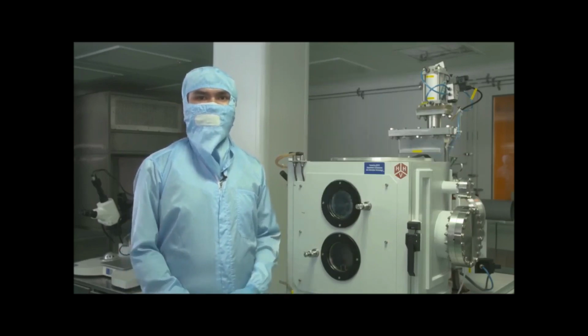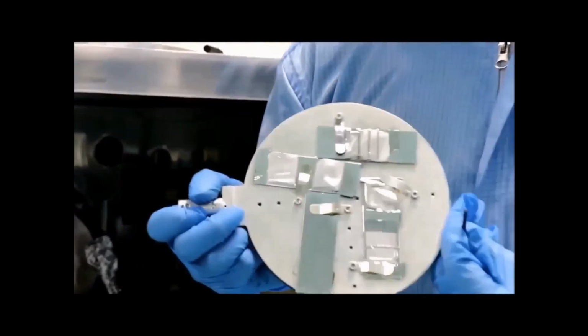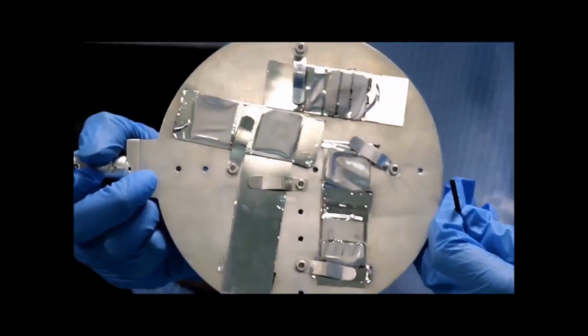This is all the process that we follow for our deposition. This is our silver deposited over the substrate, and it is very uniform, and you can see the silver deposited over the substrate.